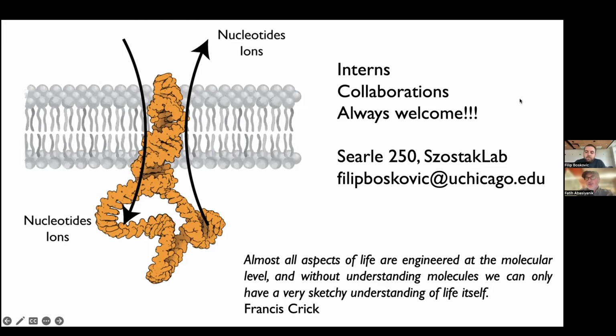Okay. The next one is also you mentioned about the reusability of the flow cell, right? We can reuse the flow cell a couple of times. Yes. Then the next question is, what about the design of the experiment? For example, let's say we have a multiplex PCR, and then we amplify the 16S RNA, and then we have lots of samples, right? Human samples or other kinds of samples. So what about the designing of sample size? What are the criteria to design the size of the sample? How many samples we can use for, especially a MinION flow cell or PromethION flow cell?